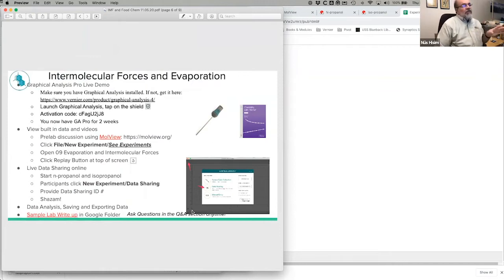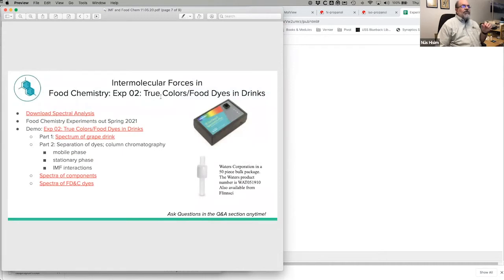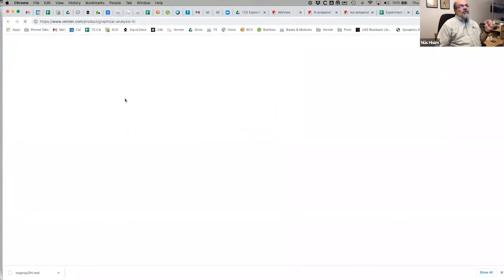So if you haven't already done it, go to vernier.com and download Graphical Analysis on your device. You're more than welcome to watch. If you just want to watch this webinar, by all means, watch. If you want to participate, you're going to need Graphical Analysis, and later on, you're also going to need Spectral Analysis. They're free. You can go to our website and download them for free.